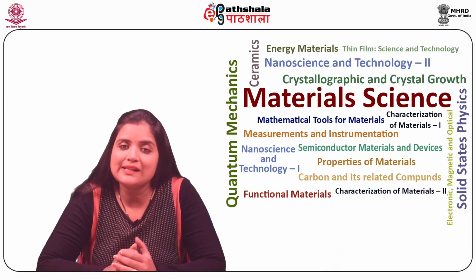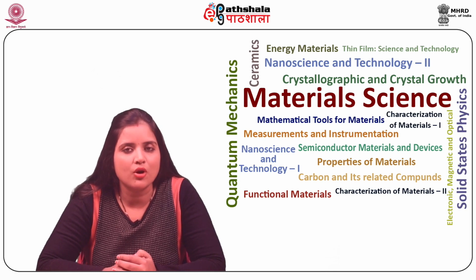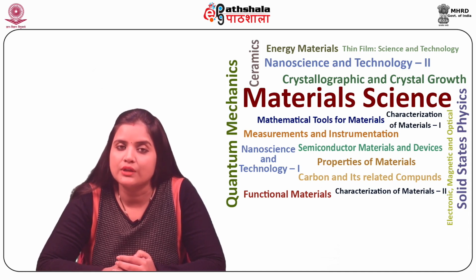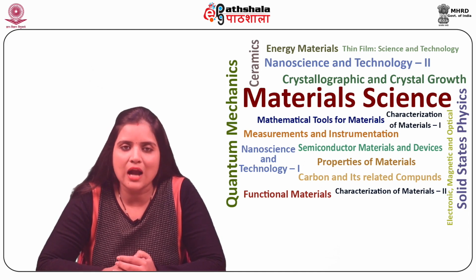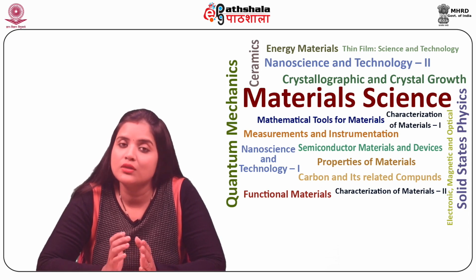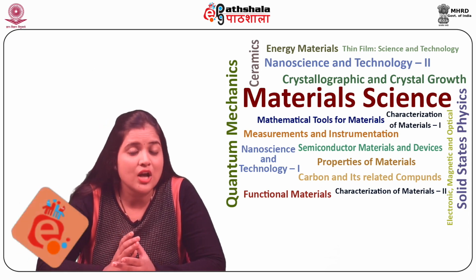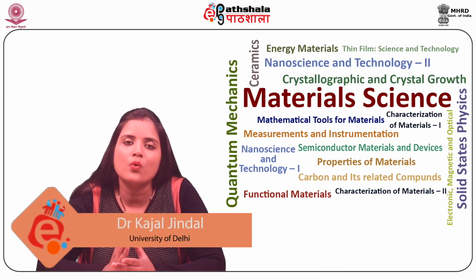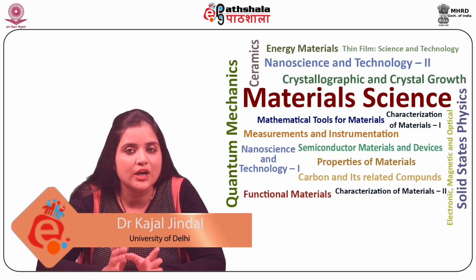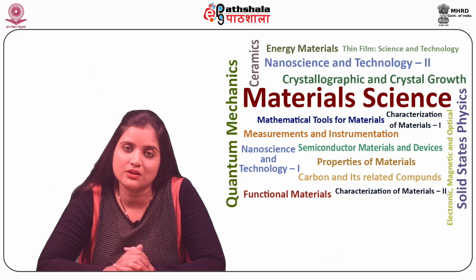So students, let us now summarize what we have learned in this module. In this module, scanning near-field optical microscopy, that is SNOM, was described. Then, the evanescent waves were described and the optical resolution was discussed. The various modes of operation, feedback mechanisms, and contrast techniques of SNOM were studied. The general setup of transmission mode SNOM was discussed in this module.